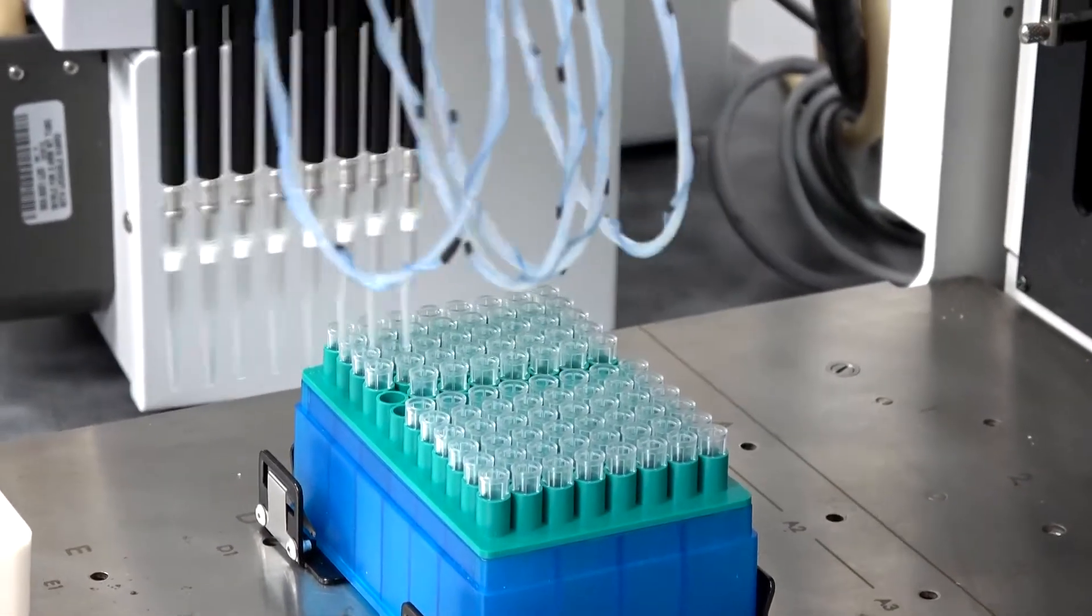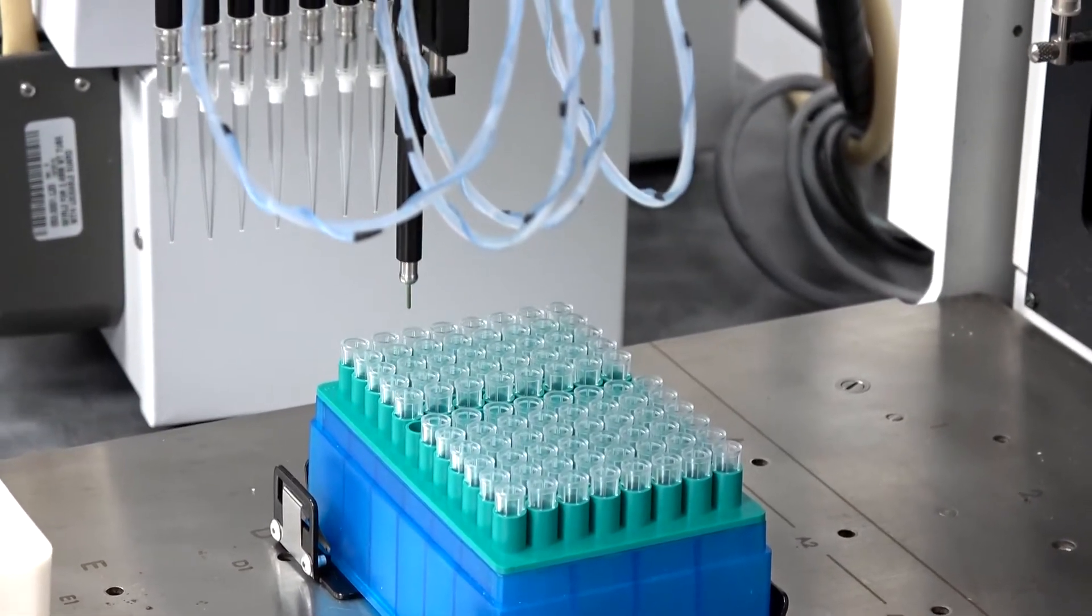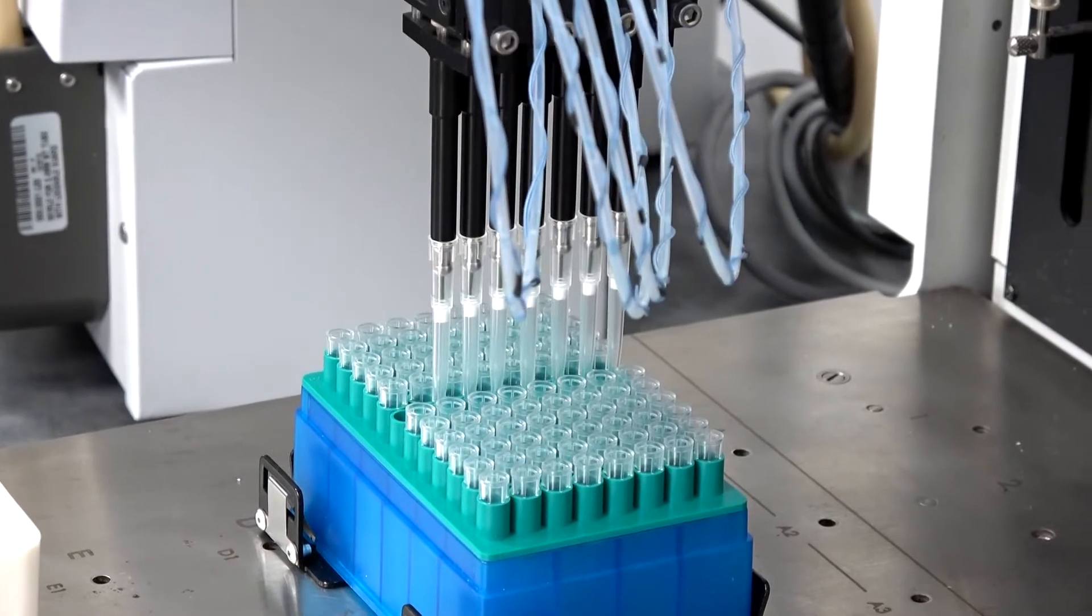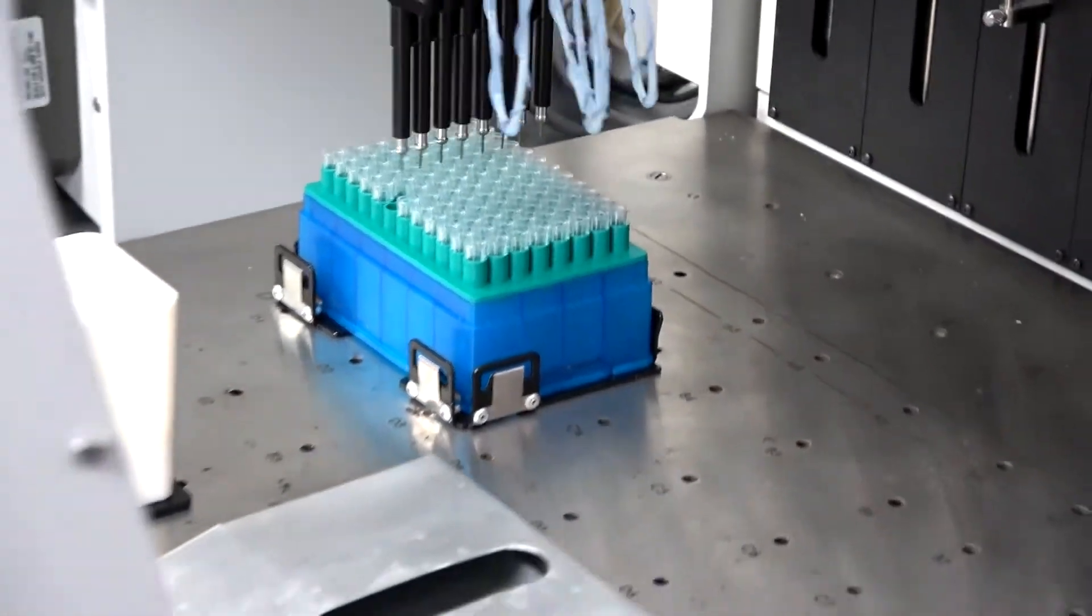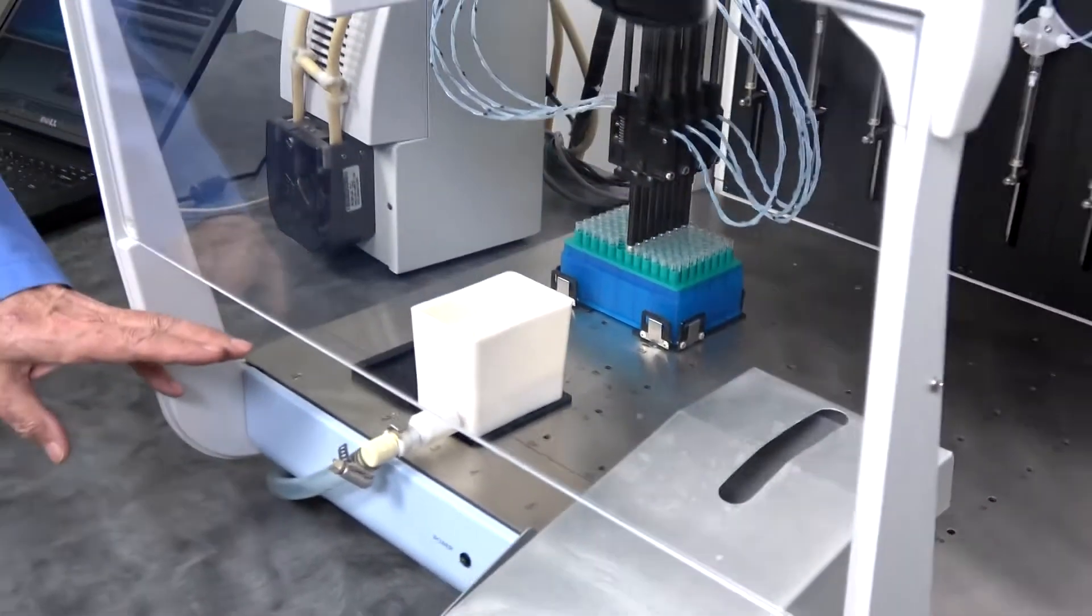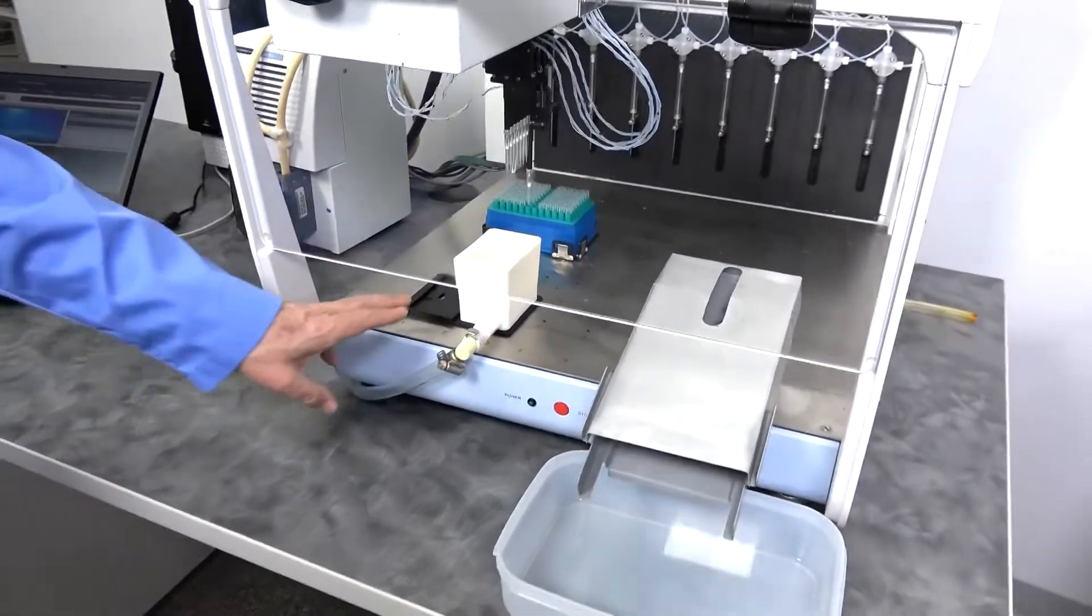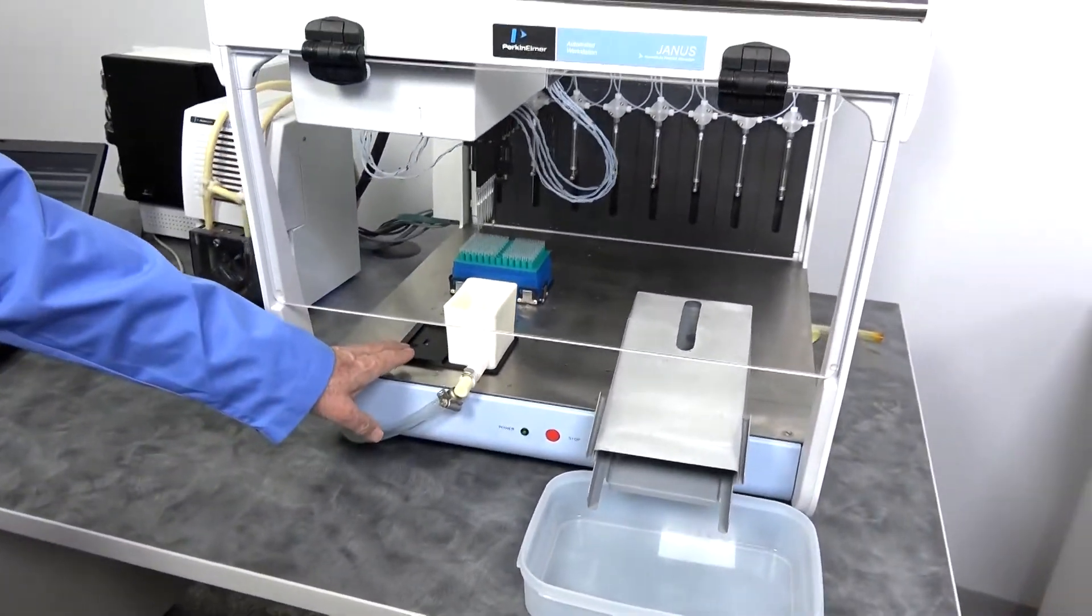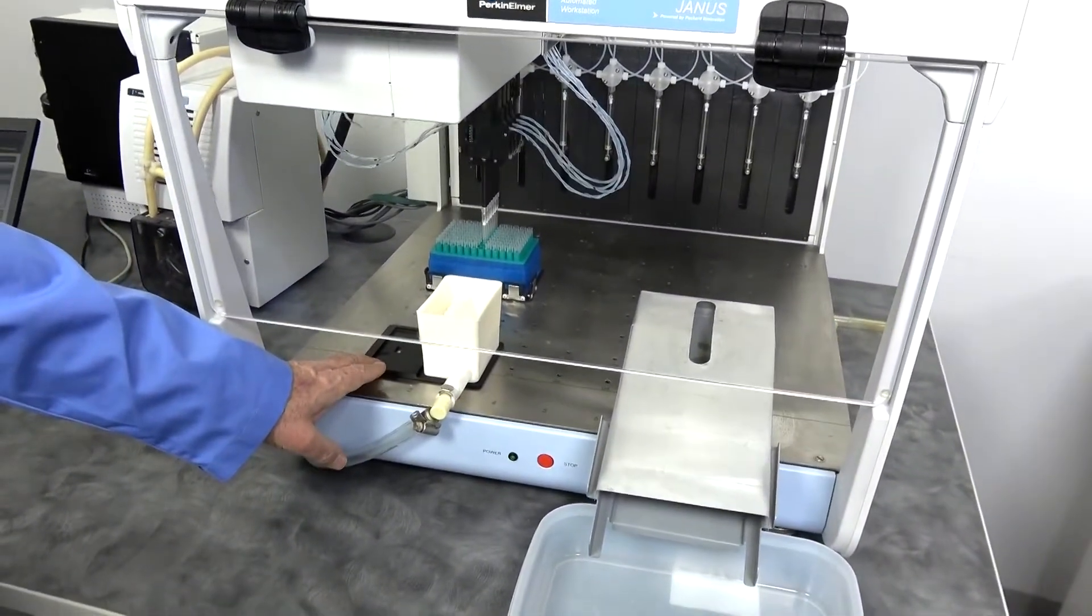There's a lot of available deckware options for this unit. You're seeing here most of a rinse system. There's normally a tub here.